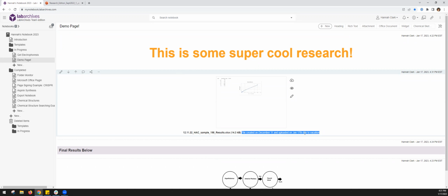For some institutions, they have LabArchives beside them at the bench. Some labs will have, in real time, they are putting this file into LabArchives. Sometimes it's a few days, a few weeks later. I'd recommend talking to the regulatory bodies in place for you. If you're looking at things like patents, talk to your attorneys. They will be able to point you in a direction to what makes sense for you. And I will say, if the Weill Cornell team has a recommendation on either of those topics, just let me know.